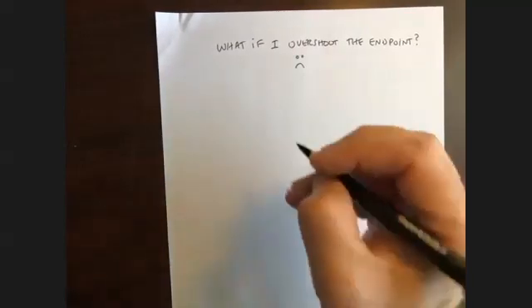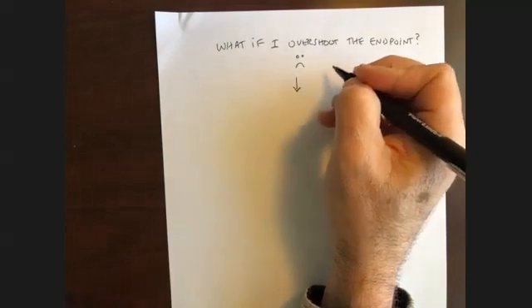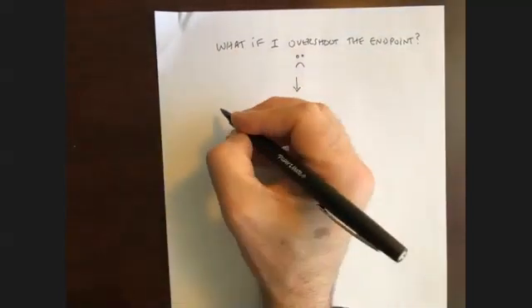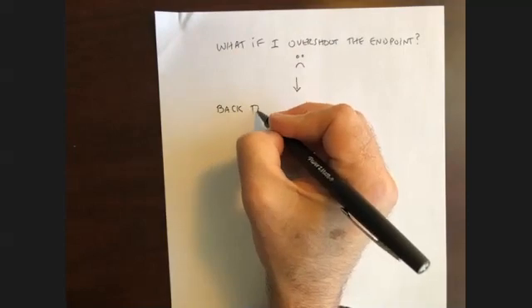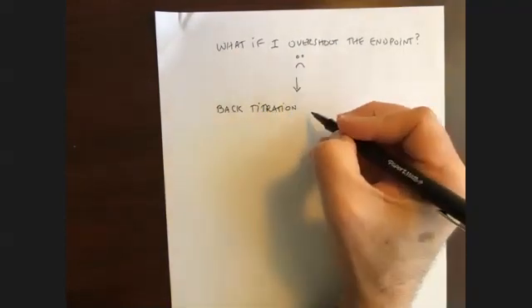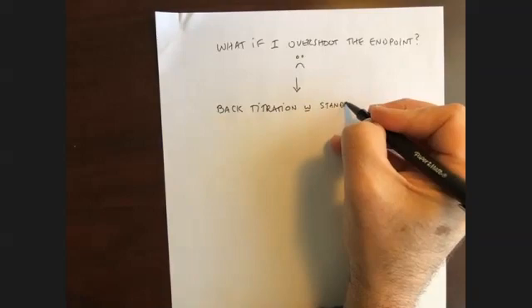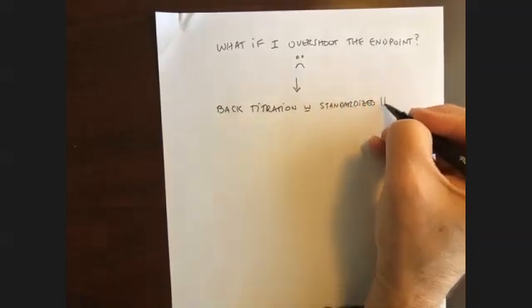What we do is we take our reaction flask, which right now is showing a neon pink color, Vegas style. And we're going to do what is called a back titration, a back titration with a burette that has standardized HCl in it.